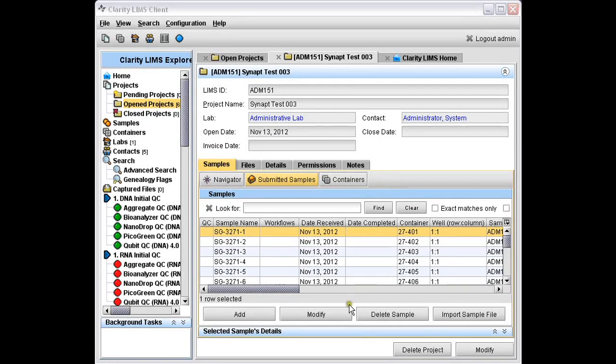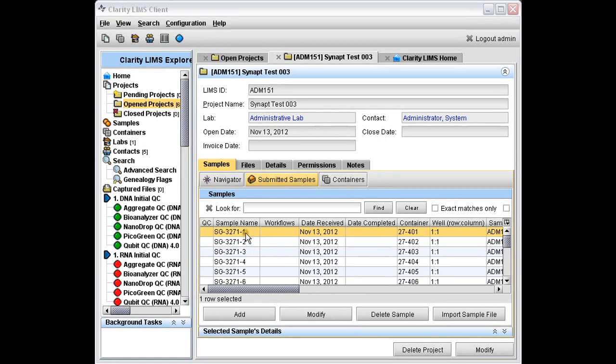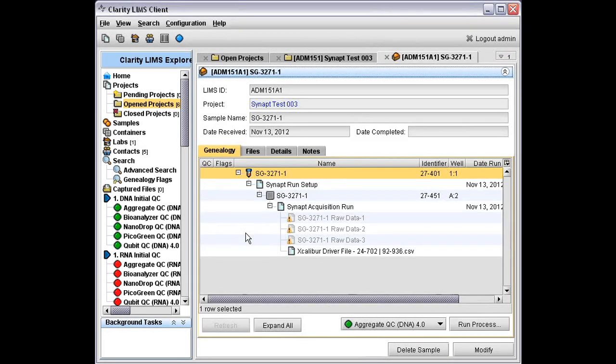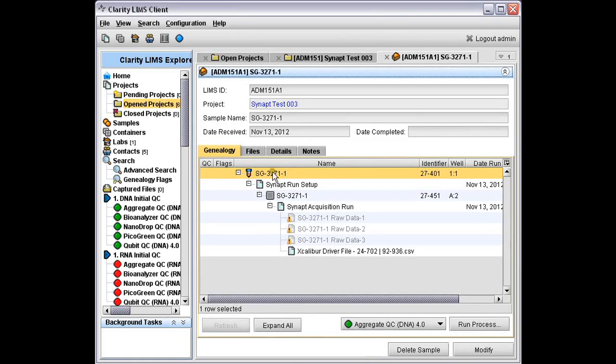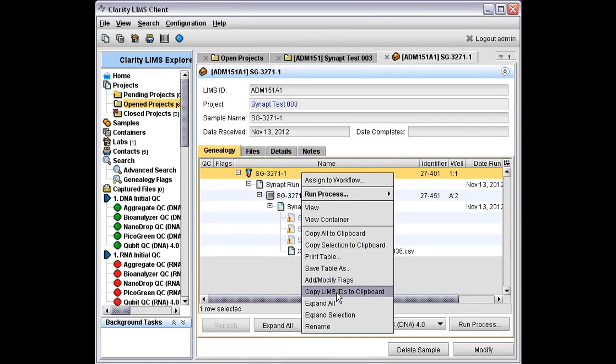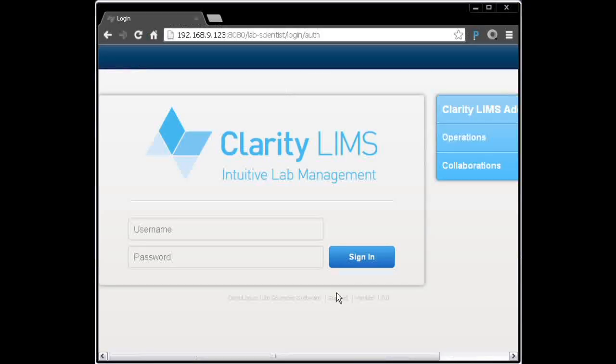I'm already logged into the operations interface, and I found some samples which already have some work done on them. I can view one of the samples here and see its genealogy. We've got a sample here. We can see its name. One feature you might find quite useful here is the ability to copy the LIMS ID, which is a unique ID, to the clipboard. Now let's switch to a web browser.